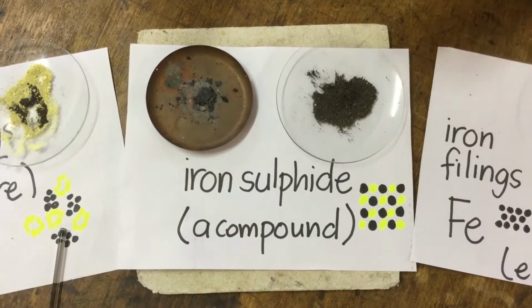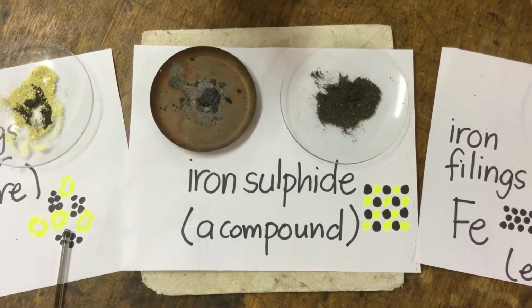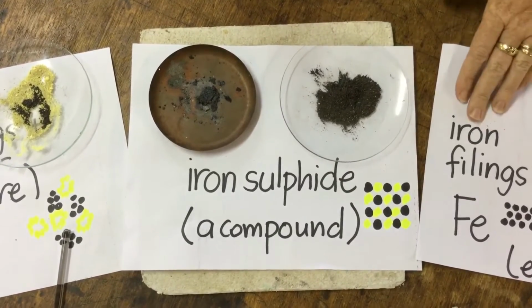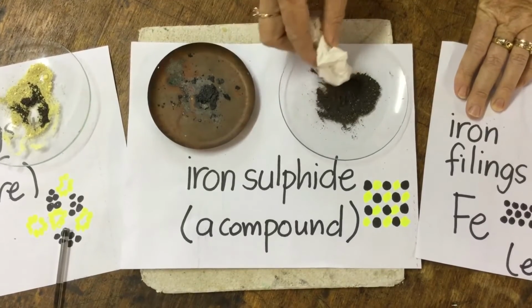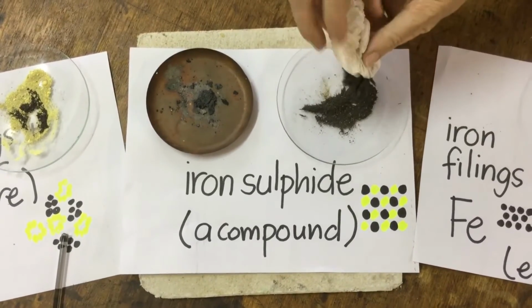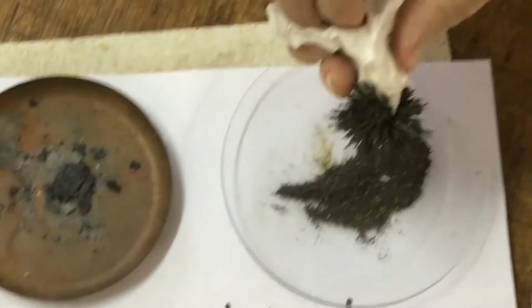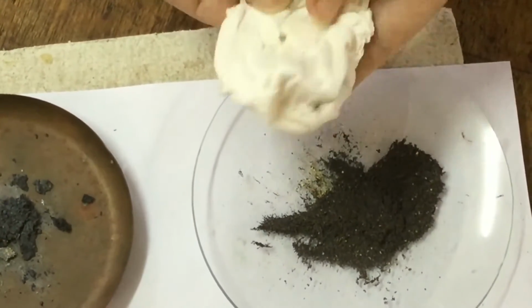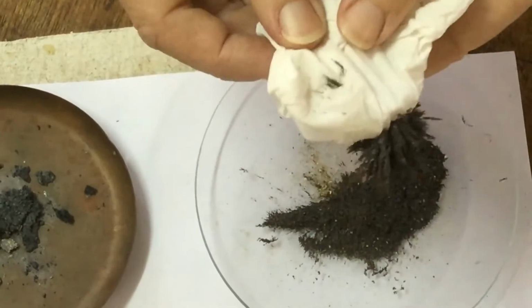Okay, so the iron sulphide compound has cooled now, and I just wanted to show you, we said that one of the properties of iron filings was that it was magnetic, and if I hold this magnet over the top, the iron filings are attracted to the magnet, like that.